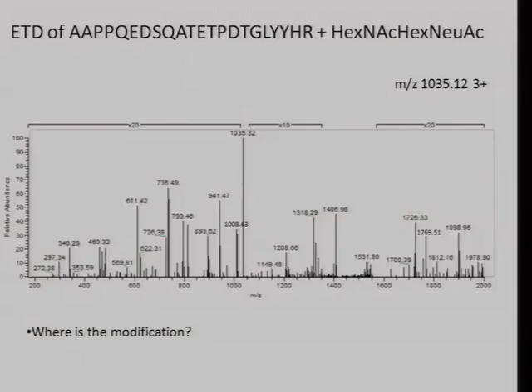On using the first software, I think instead of you have to select the number of sugars you imagine to account for the mass of the glycan. Yeah. If the software can propose all the structures you can have. Yes. So there is software where you can give it a database of sugar structures you can consider, and then it would match it based on that.